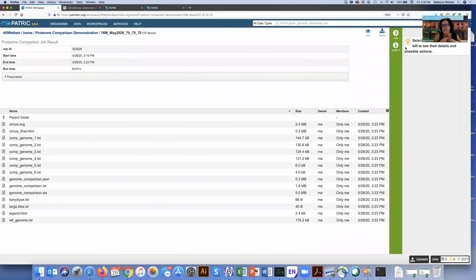Okay, this is going to give me all the information I want about this particular job. I hope it's all the information you want. It's a lot of information. Up here are hyperlinks to some of the folders that are the files that we have here, and the ability to download different things from the job. Across the top is a breadcrumb. This is the name of my job. It tells me it's in this folder in my home directory of my private workspace.